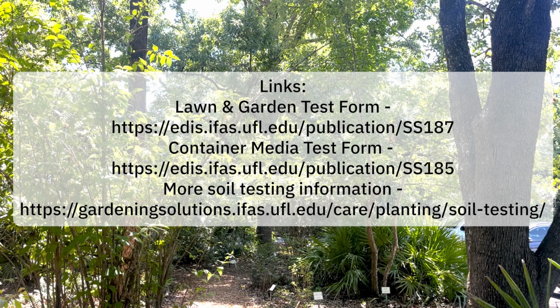Remember, when filling out your forms, make sure to indicate Leon as your county, as this gives a copy of your sample results to our Master Gardener volunteers and horticultural agents on top of the results that are sent directly to you in 7 to 10 business days via email. Now that you have completed your soil collections, you can send them off using the instructions listed on the forms. All of the forms provided in this video can be found at these links.